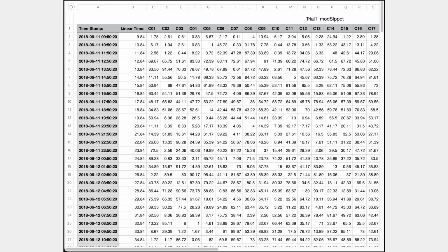The %sleep-wake per user-defined interval option generates a CSV file with %sleep computed over a user-defined interval in minutes, with a default value of 60. The first column of the export consists of the timestamps corresponding to a sequence of start times for each interval.